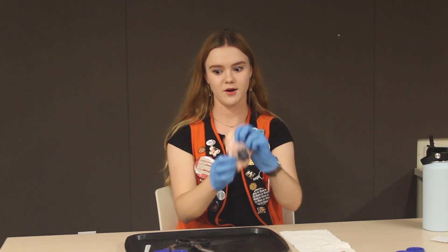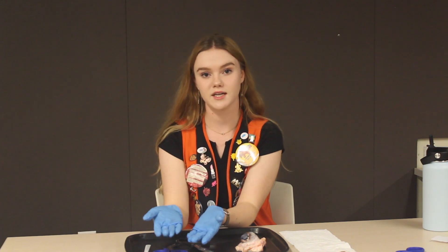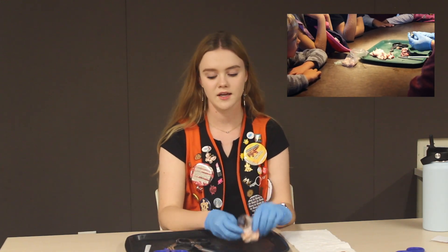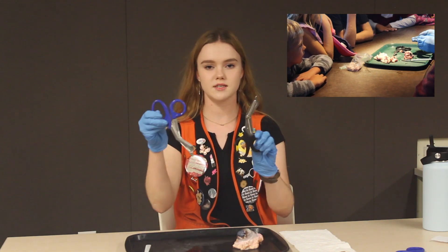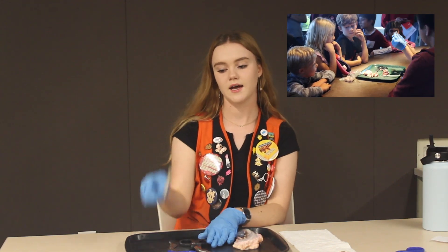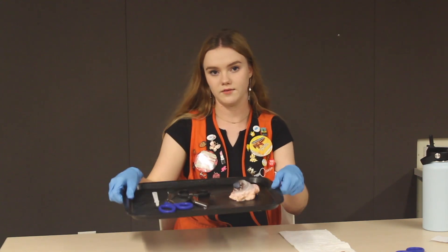So what you need is, of course, a cow eyeball. I also like to have a second one here in a plastic bag so visitors can touch it while I'm doing my own dissection. Also a couple pairs of scissors, because sometimes they're not super good so always want to have a backup pair, a scalpel, and then a tray to set all of your supplies on.